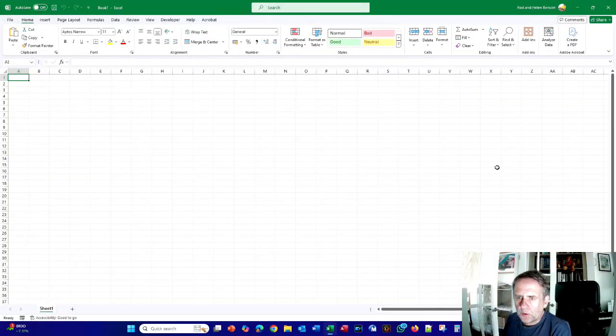Welcome to the tutorial on how to install the Platemaker wizard. So you can see I have Excel open on my computer, and this is just a standard install of Excel. You also need to have Access installed on your computer as well, but if you have Microsoft Office 365, both programs are included in that suite.